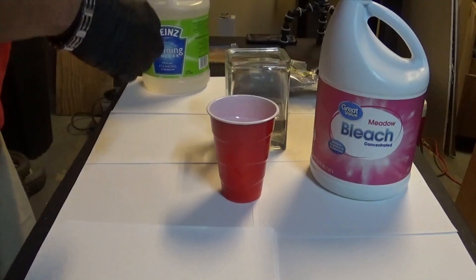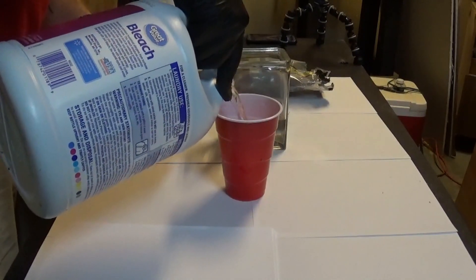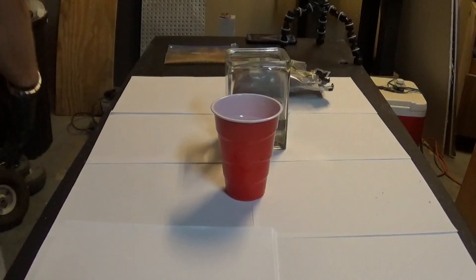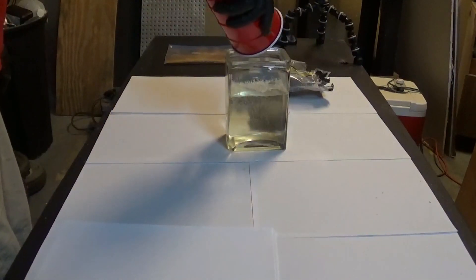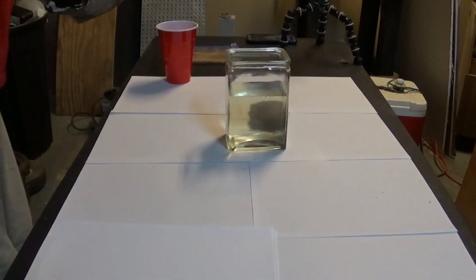Now I'm going to do something with this bleach — guessing half a cup. Yep, half a cup. I put that away and poured it into the square jar as well.